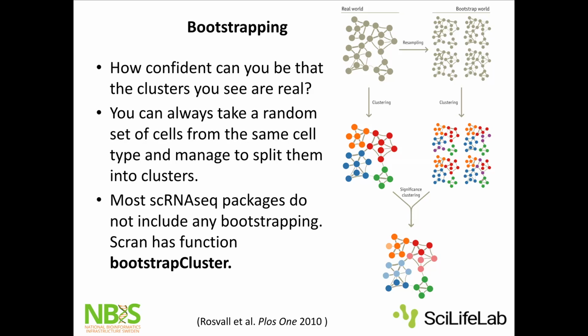If you split your data and then you calculate your clusters or communities, and if you consistently get the same cells together in the same cluster, regardless of which iteration of your bootstrap, you can be more confident that it's a consistent clustering. And I don't know why the single cell community has chosen not to do bootstrap. There are a few papers where they do. Maybe it's mainly because we have a lot of cells and it's compute heavy.